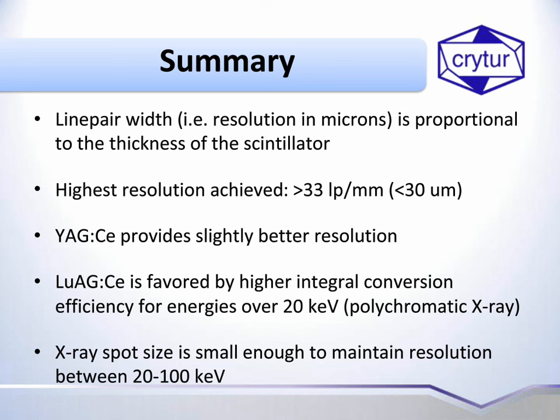Colin, I had a little trouble hearing what you were saying. I think that the connection was not good. I was wondering if you wouldn't mind repeating it, just in case others couldn't hear the answer. Sorry, the fiber is directly bonded onto the sensor, and that is a permanent bond. We offer other fibers on top, so you're able to effectively have another fiber you can apply onto that. But the camera core is bonded and is a permanent bond.